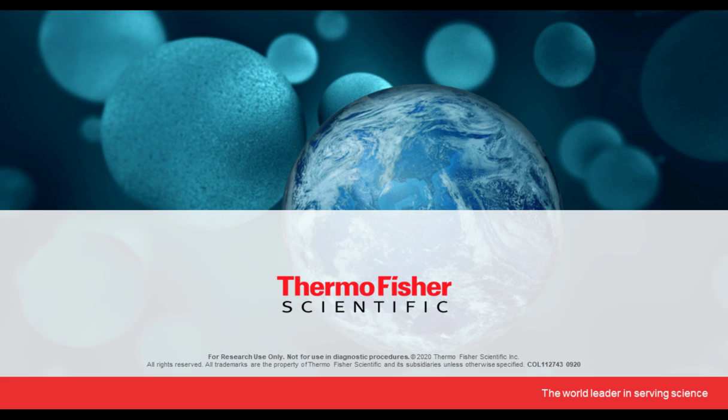There can be some factors, like background with any fluorescent method. There is always a possibility that, depending upon how you have labeled and how you have processed that whole labeling, you may get some background. If there is uneven background in the membrane for some reason, which typically does not happen, then the background can add some variability to your signal.